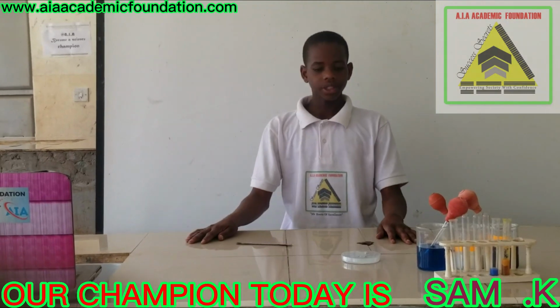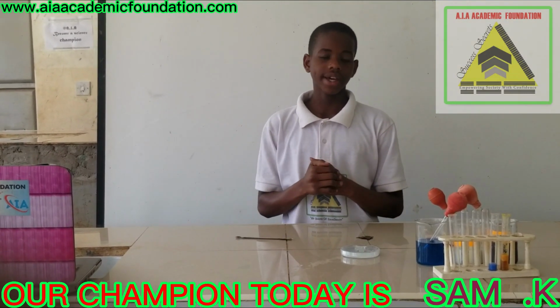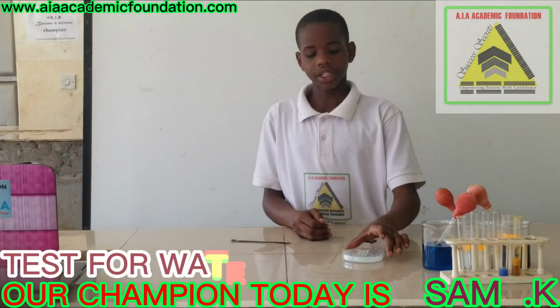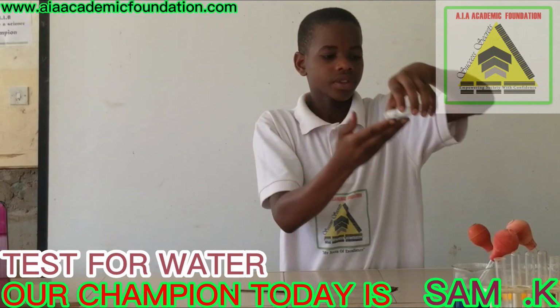So next, allow me to carry out an experiment to determine whether there is water in milk. And what we shall need here is the anhydrous copper sulfate, which is white in color, and the milk.